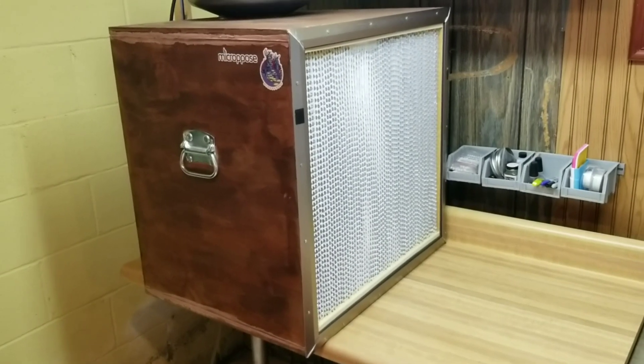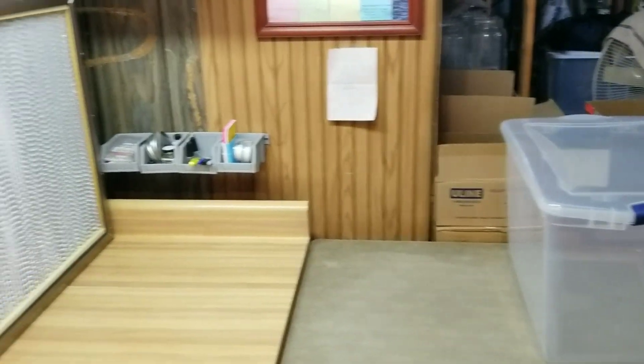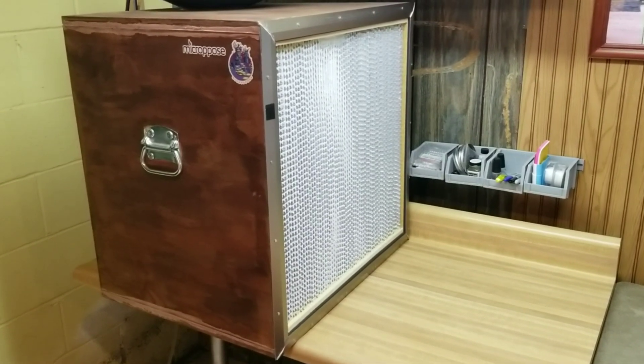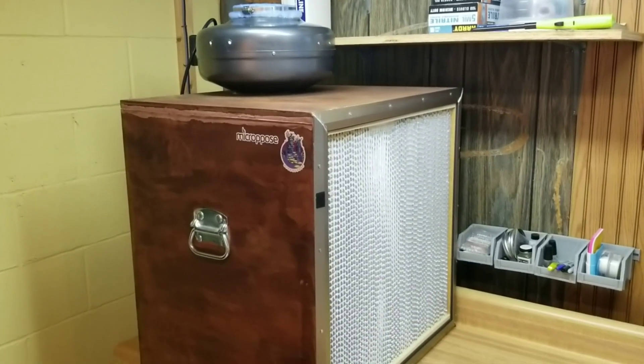Hey, what's up guys? Welcome back to the Mushroom Dungeon. I'm actually getting ready to do a big run of liquid culture here. I just ran a bunch of jars in the PC and I'm going to refresh some old cultures, get some new ones going. But I figured this would be a good time to do a flow hood tour.